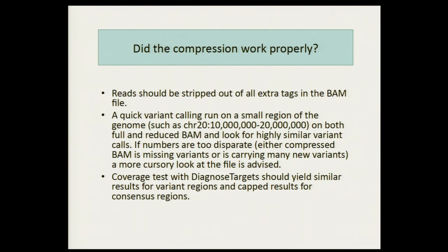And there is practically no difference, since we're talking about a consensus read, so everything had the same base. If you saw it 128 times, you were already extremely confident that that is the right call. So it's insignificant to say, oh no, it's not 128x, it's 2000x. It's overkill. So we decided to keep it short just to save some space.